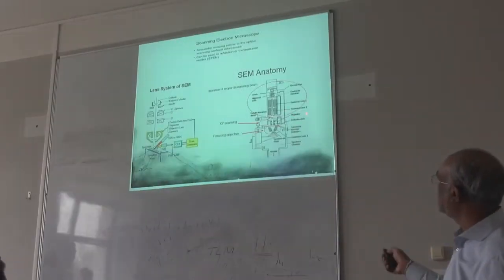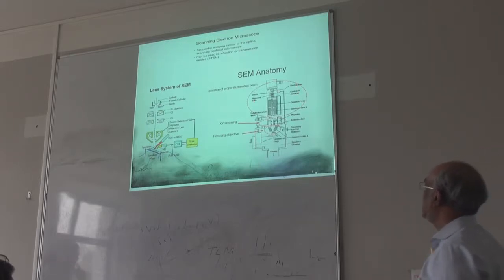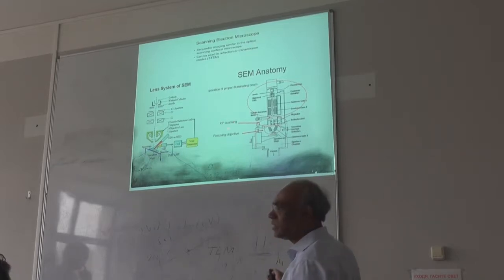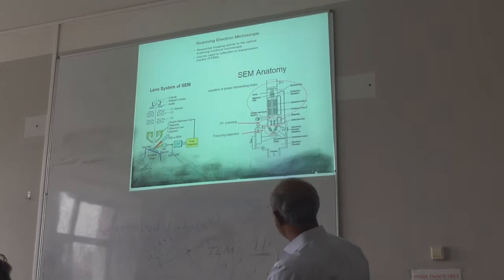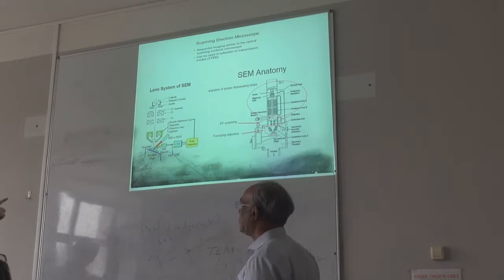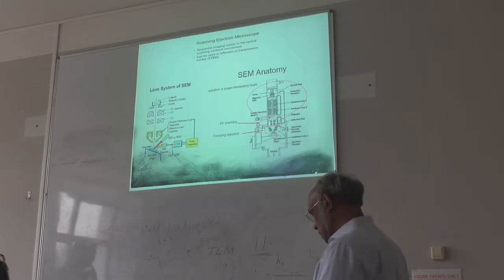But this picture shows all the components here. The important thing is this scanning. The beam is scanning through the sample, and you can do either the beam or the sample also. We do magnetic scanning using a magnetic lens. Yes, that's what we do. No mechanical movement. Yes, exactly.